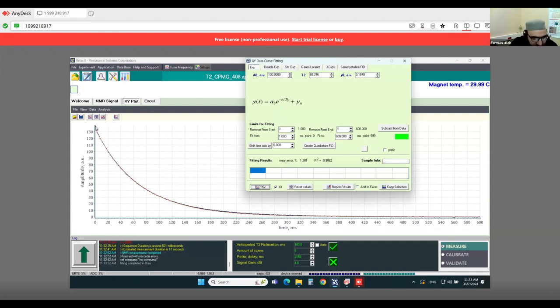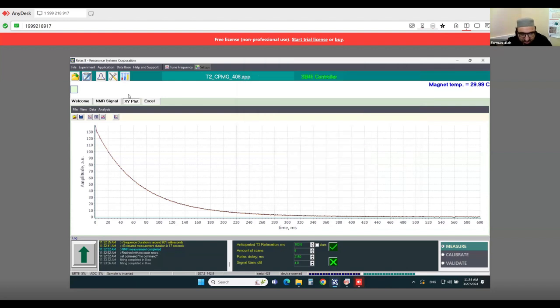The first thing is that this part is not clear, so we will reduce our time of observations. The second thing is when I apply, it's not fully fitted, and similarly I apply again, which is also not fitting. So it means that the observation time I took is not accurate, so I will change it again.